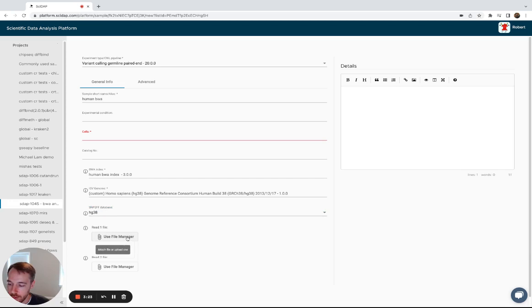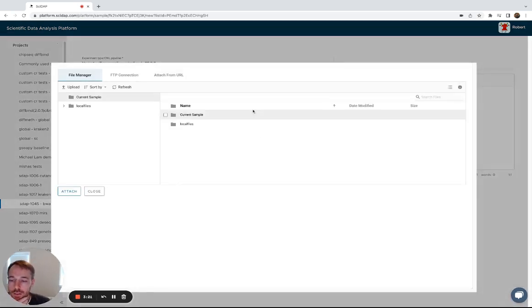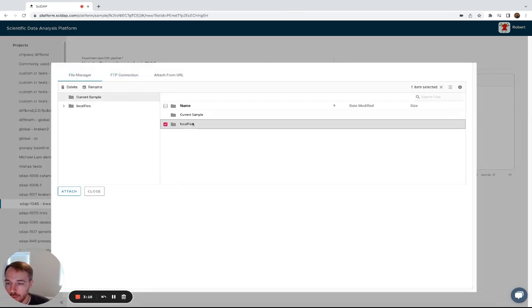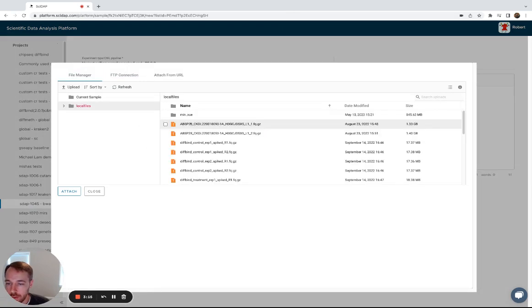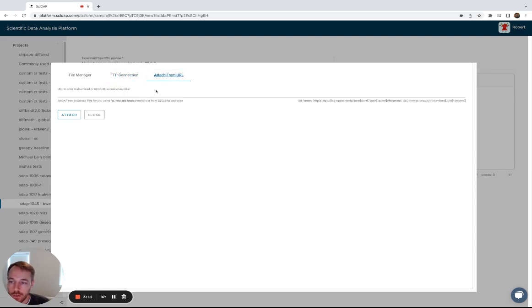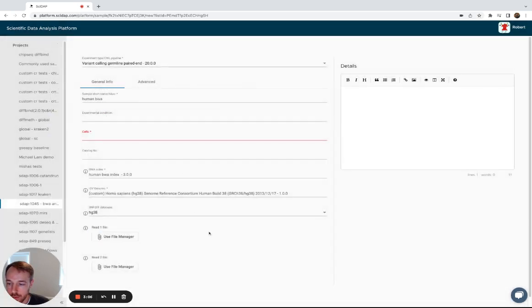And as with our other workflows, you'll upload data with our file manager for local files that are already on your satellite, or FTP connections from a genome core, or using the public data such as geo accession numbers.